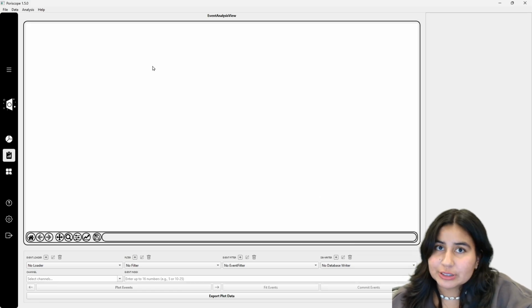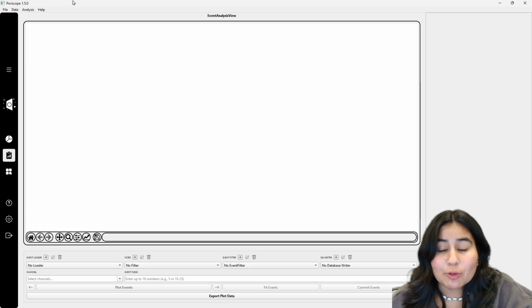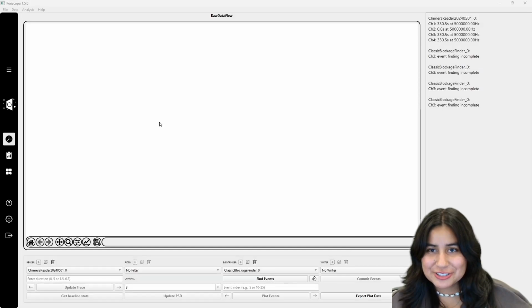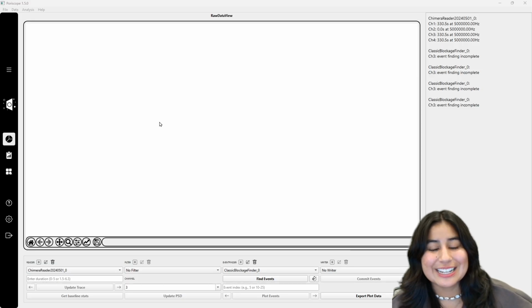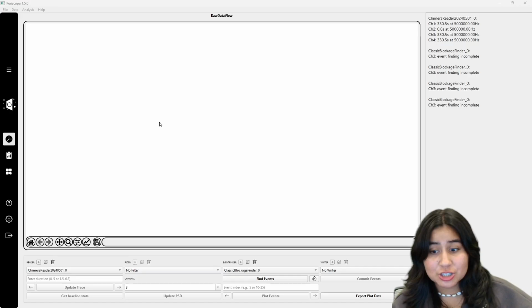And what triggers the progress area is any action that requires heavy computation. It will show you the progress for one or many of these actions that you have taken. So as you can see, I have taken some actions here, but don't worry about it. You will understand what's going on in section 2, in part 2 of this tutorial series. In the meantime, I just wanted you to be able to see the three different sections of the main view.